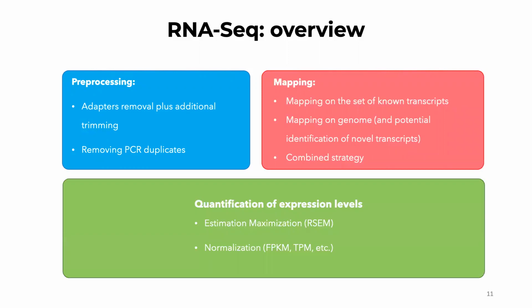Again, you have a few different options. Now, some more recently developed methods seek to reduce the memory usage and do what's called alignment-free quantification. Those include salmon and sailfish. And so we have those also on the platform, and you can try and work with those. Those will only give you quantification of transcripts that are known. So they do not look for actual genomic variation. They look only at known transcripts.